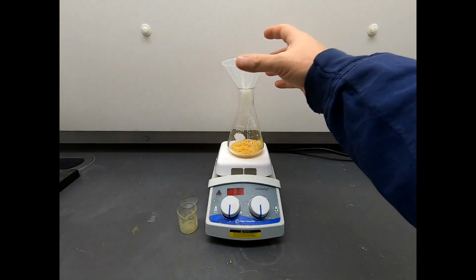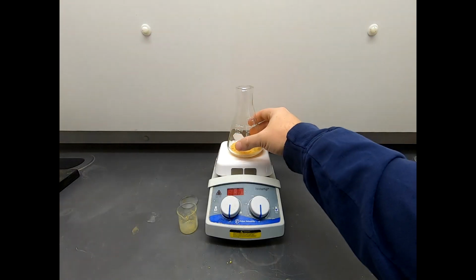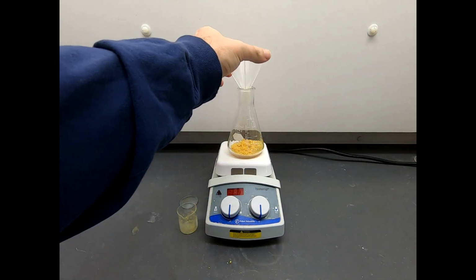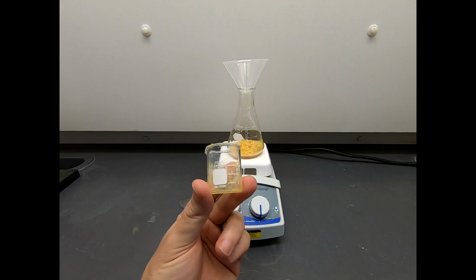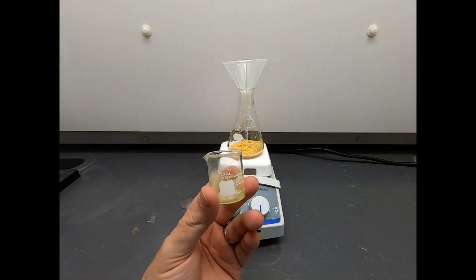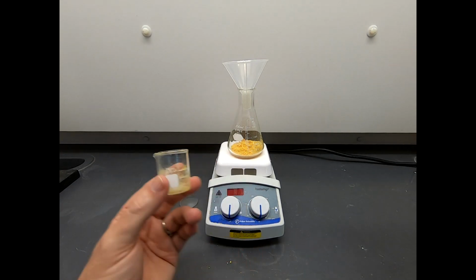Okay, now all this solid has been transferred into this Erlenmeyer flask. There is just a little bit of solid in the funnel. We'll take care of that as we can. And just a little bit of solid left in the beaker. Really, this is a very small amount. I'm not worried about this too much, but we'll try to rinse this out a bit.